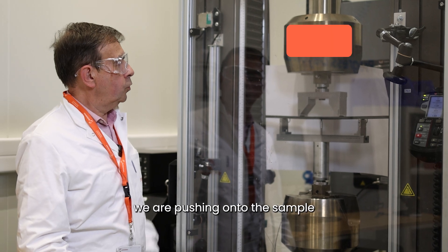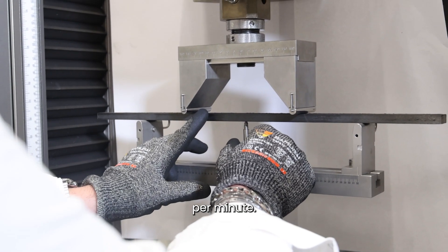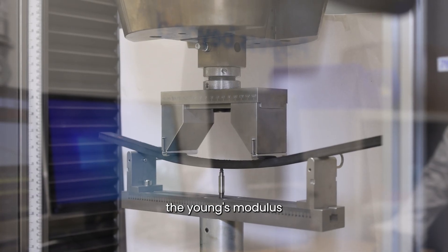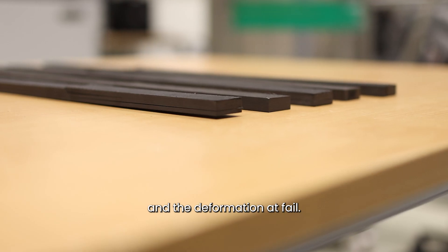During the flexural test, we are pushing onto the sample with a speed of one millimeter per minute. From this test, we can evaluate the stiffness, the Young's modulus, and also the resistance and the deformation at failure.